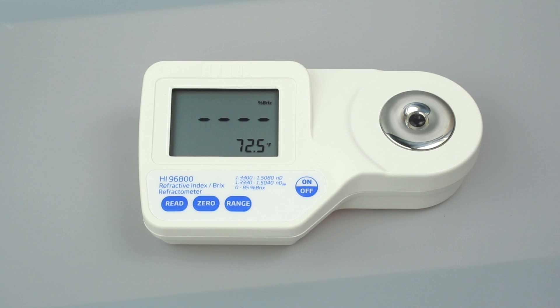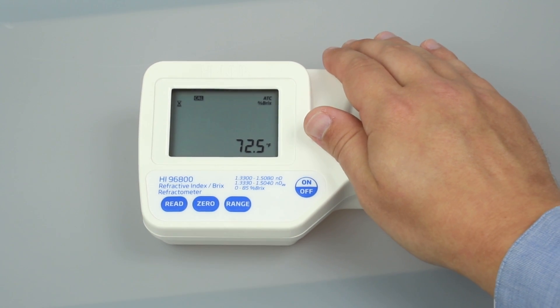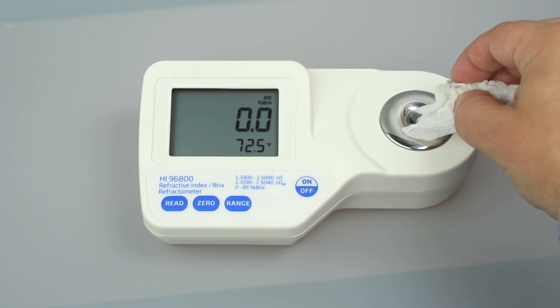If there is a strong light source nearby, cover the prism with your hand. Press the 0 button. Once 0 appears on the screen, use a soft tissue to absorb the deionized water off the prism.